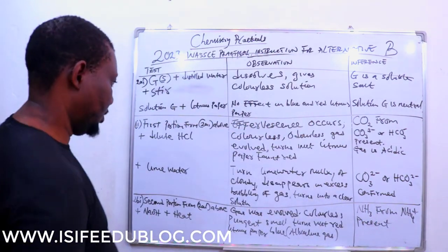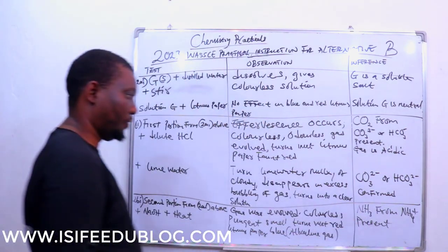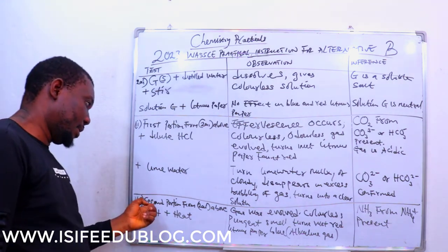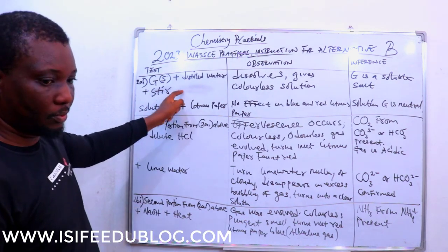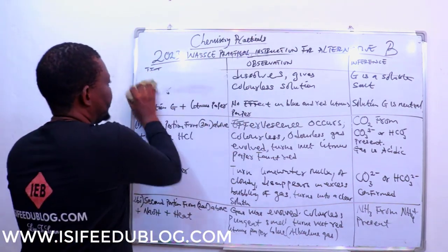But this is not the end of it, because you must confirm it is actually NH4 plus. How do you confirm it? This is the continuation of this.